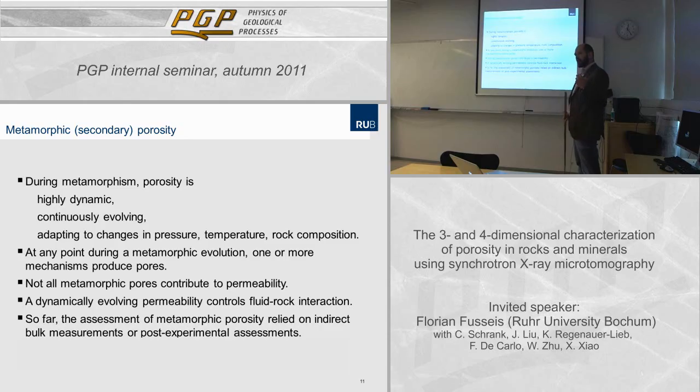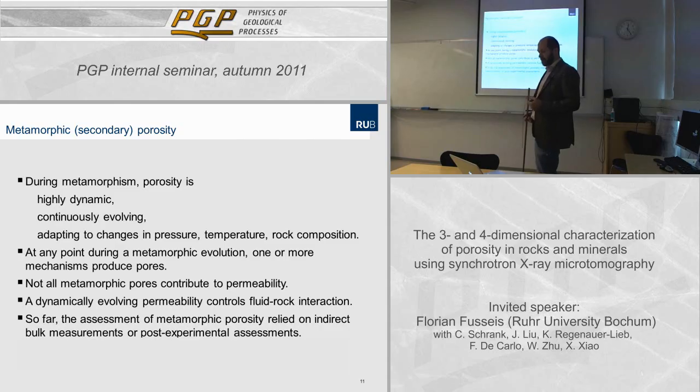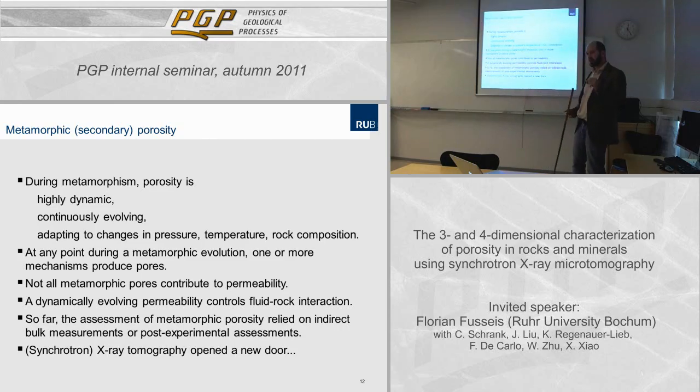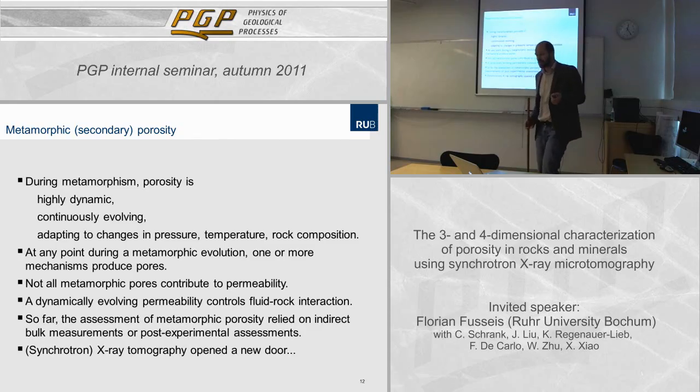So we take the sample out of an experimental array, cut it open, make a thin section, and interpret what happened before, and the same is true for any piece of rock that we collect in the field. Obviously, we try to learn what might have happened or most likely happened. Synchrotron X-ray tomography, and synchrotron is in brackets here because X-ray tomography is one of a series of novel techniques that allows us to study these processes while they're happening, technically, at least in a non-destructive fashion.